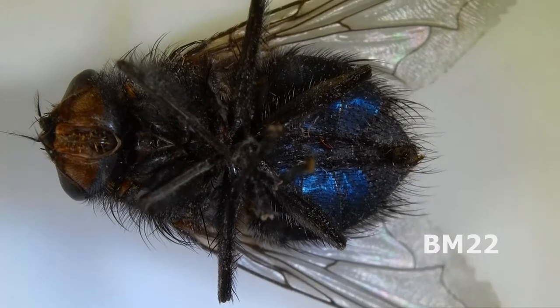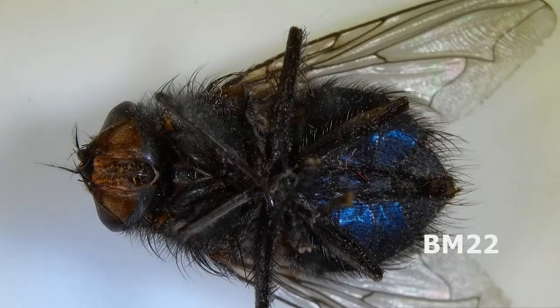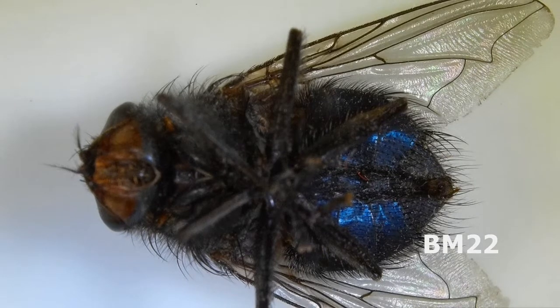Hi everybody, Beanmeister22 here. Today we're going to do something — well, oh man, I don't even know how to describe it. We are going to look at a common housefly under high magnification. We're going to use the KK Moon video microscope and we're going to look at a housefly.